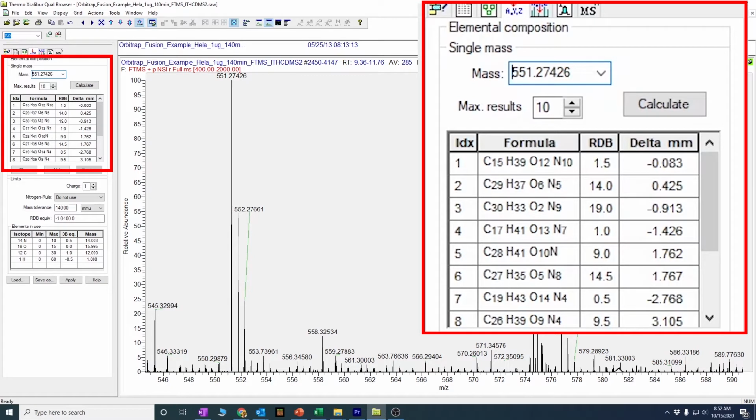A quick note here about exact mass and calculating exact mass. You have to be careful, because say you have C4H10, butane, and you want to calculate its exact mass, you need to specify which isotope you're using. Carbon-12 does in fact have an exact mass of 12.00000, because that's how we define mass in the periodic table. But that is the only isotope of all the elements and isotopes in the table that has exactly 0.000. Everybody else is going to have mass defect.